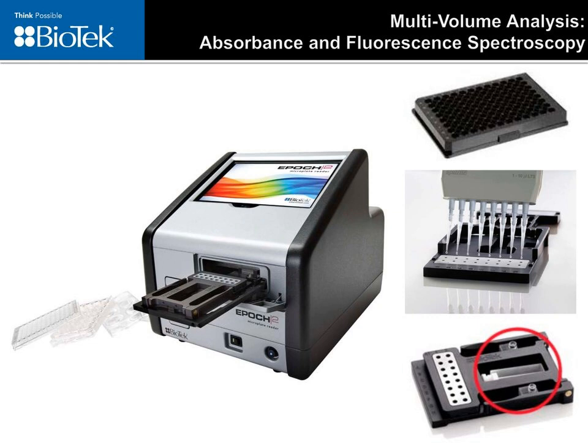And by using a microplate reader in conjunction with a multi-volume plate, which I'll discuss and is pictured here in the middle of the slide and the lower right, the functionality can be extended to include microvolume analysis as well as accommodation of a 1 centimeter path length vessel, such as a standard cuvette, which is shown in the image as well, or to biocells, which is a vertical path length vessel as well. The ability to perform microvolume assays allows for preservation of precious samples, and this in comparison to the more traditional vessels which require larger volumes.